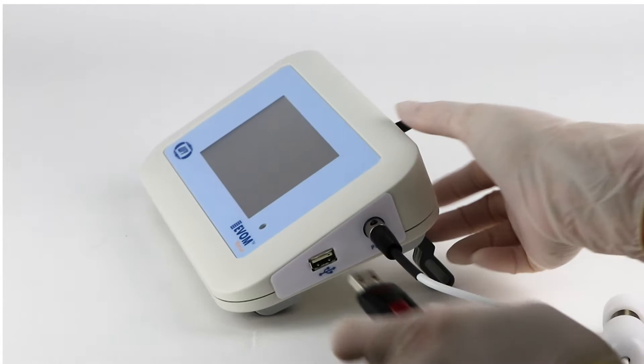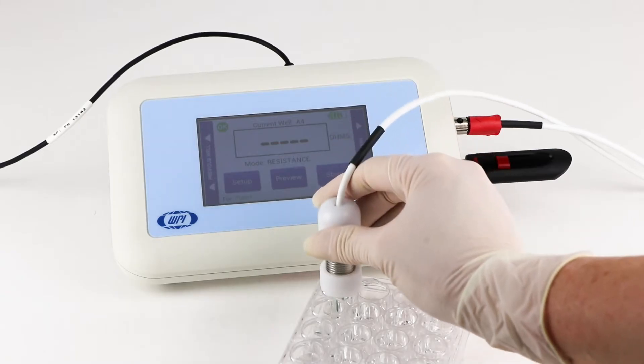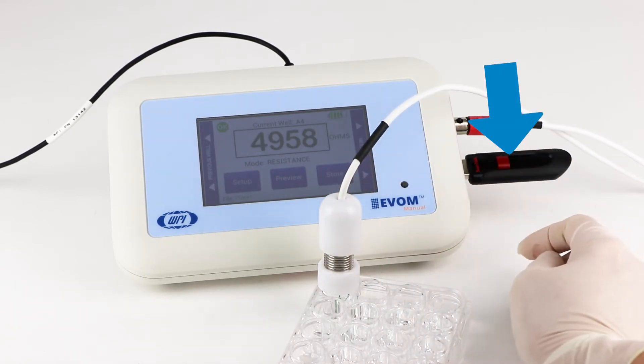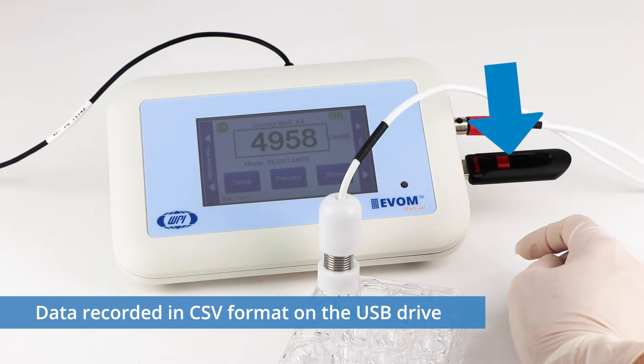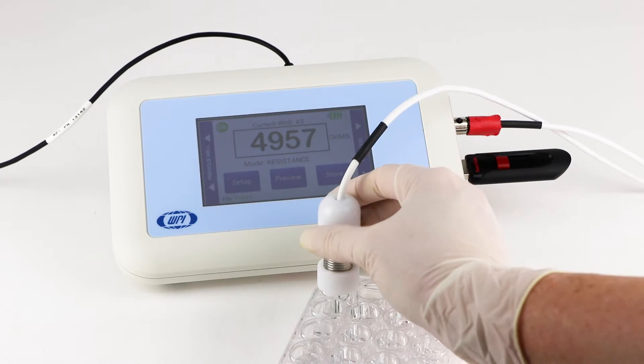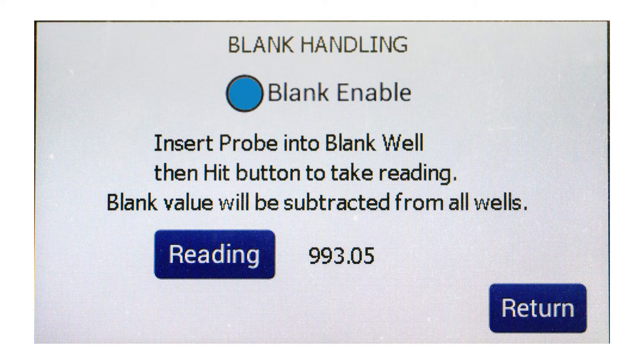Second, auto data logging eliminates the need to track data by hand. The resistance or voltage information for each measurement is written to the USB drive in a CSV format that can be opened by most spreadsheet programs. You can quickly and accurately move from one sample to the next to record your data, and you can automatically subtract the blank reading from your measurements.